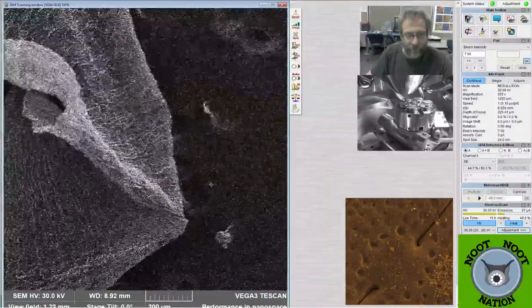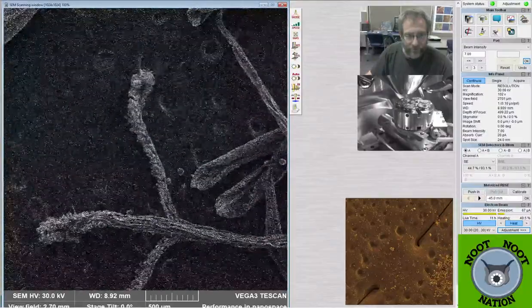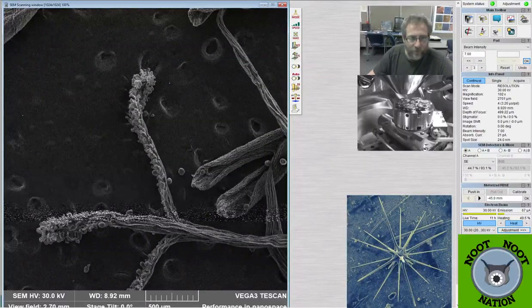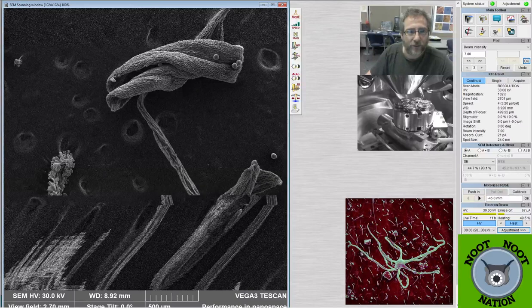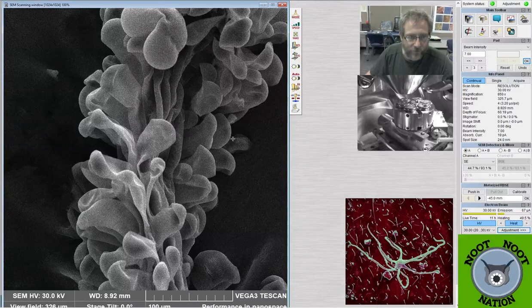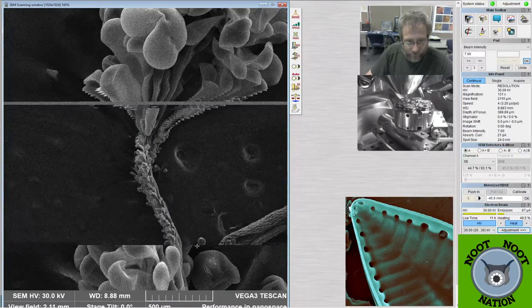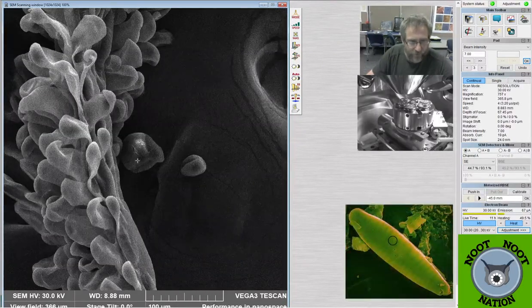And we were looking at the actual pollen grains earlier from it, and these are the anthers, and these are the pollen grains in here. So if I change the beam, you can actually see them. That's the part that produces the pollen right here. And there's some pollen grains. Got some images of those as well. You can zoom in and look at some of this if you'd like. These are the cells associated with the anther, which is the part of the plant that makes the pollen. And then that's some pollen right there in the background. This stuff right here is pollen from it.